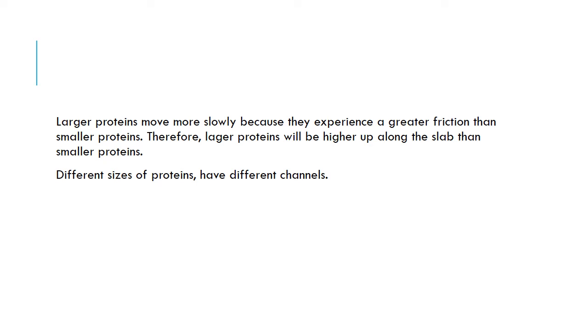If this is highly charged, we are expecting the frictional force to be greater compared to this one, which has only a few charged particles attached to it, hence bringing about the smaller molecules moving faster compared to the larger molecules.